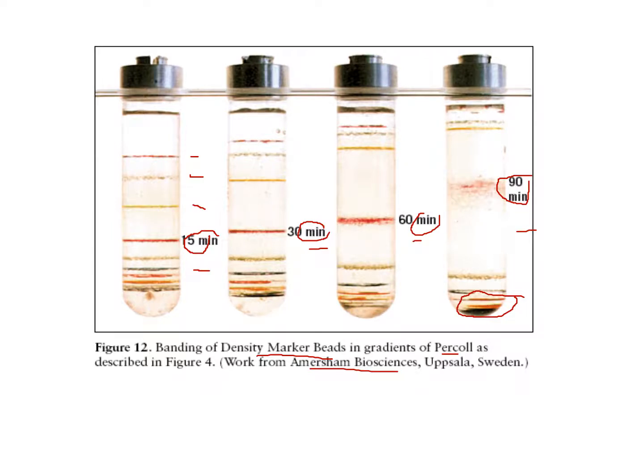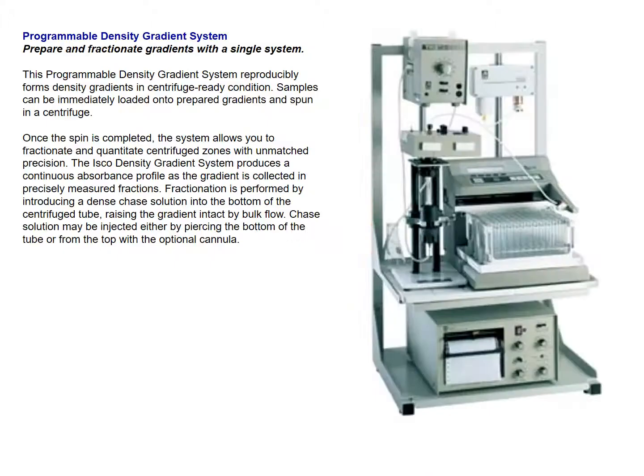Okay, so you're asking, how do we visualize this? They have colors. You can take a picture of this, and then you can figure out exactly what these densities are, and you can plot on graph paper the densities and see the differential here. So again, too much time and everybody's pelleted, and you've lost a lot at that point. Not a lot of separation at that point.